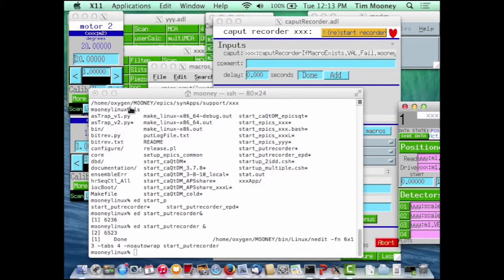Then if we have a stable of software for doing all the little things that have to be done generally in experiments, you can just bolt those together in different order and support the exact instance of the experiment that they want to do. And then you don't have to actually negotiate this user interface. You can just roll your own. I think Sector 4, if they use this at all, they're certainly going to use it that way.